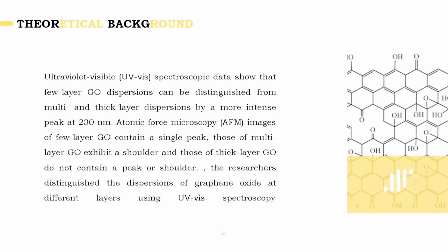Moreover, from previous UV-vis spectroscopic studies, it was inferred that the optical absorption of graphene oxide is dominated by the pi to pi* plasmon peak near 230 nanometers. The pi to pi* plasmon peak depends on two kinds of conjugative effect. One is related to nanometer scale sp2 clusters, and the other arises from linking chromophore units such as carbon-carbon and carbon-oxygen bonds. If all sp2 clusters are treated as a single phenyl ring, spectral changes in graphene oxide should depend only on the effect of chromophore aggregation.